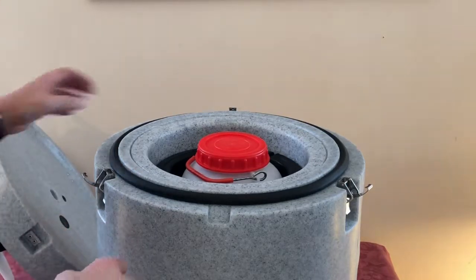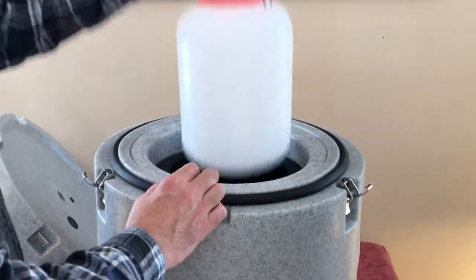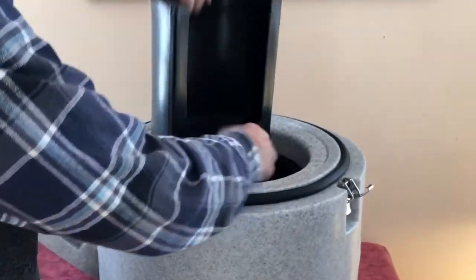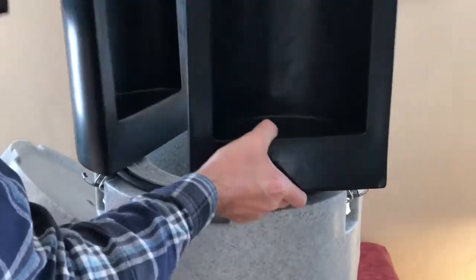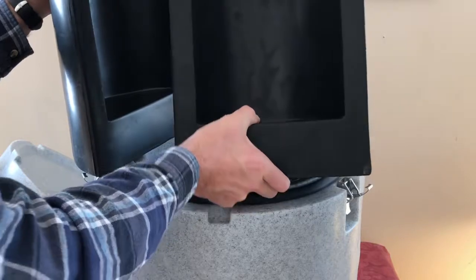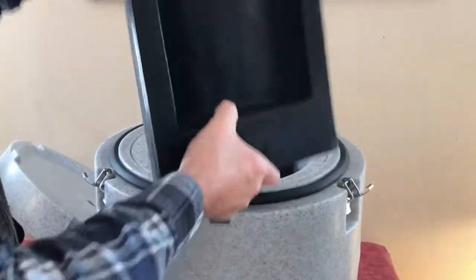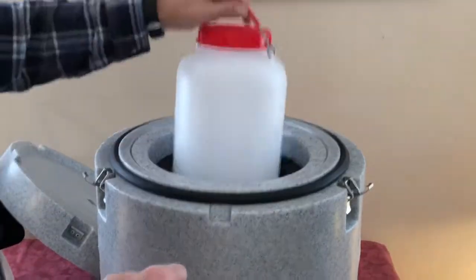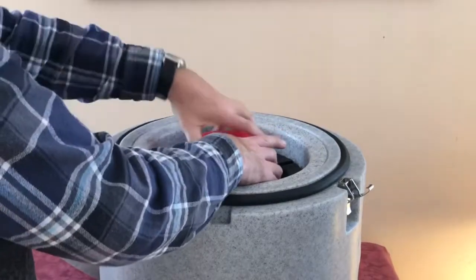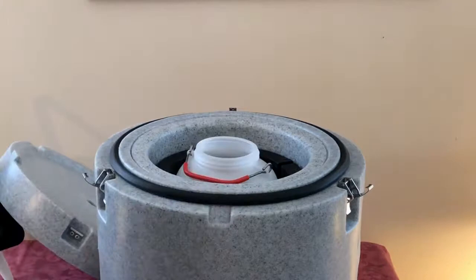Let's see if I can drop some stuff all over the place here. Sampler container lifts out. And you have the integrated freezing units. So what you do is go ahead and freeze these in advance, and then drop them into the insulated box. Drop your sampler container in, open the lid, and retain this for later.